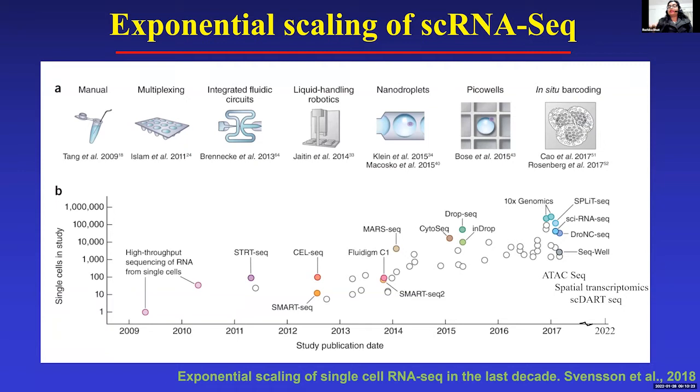And there is also spatial transcriptomics, which identifies the spatial arrangement and the movement of cells under specific conditions. And there is the single cell DART technique, which is single cell deep learning ATAC-seq and RNA trajectory-seq analysis.